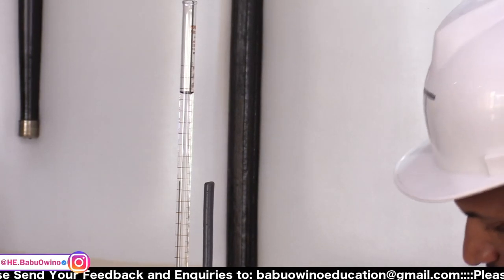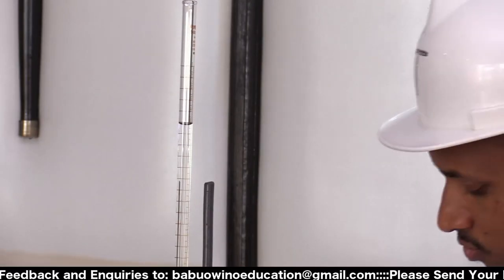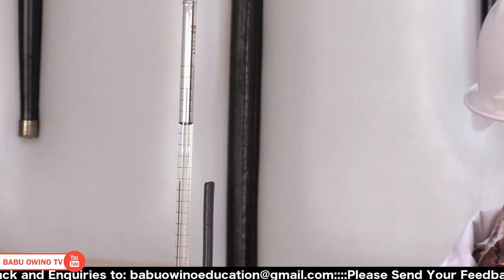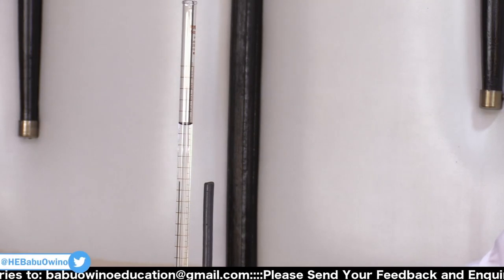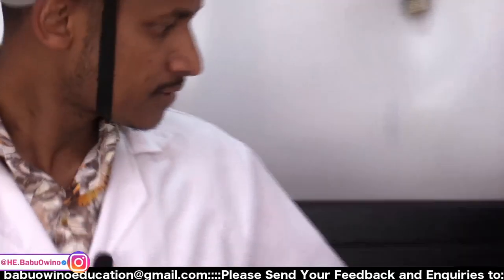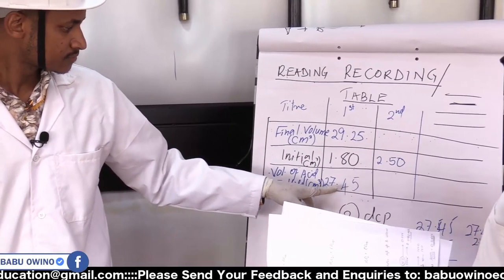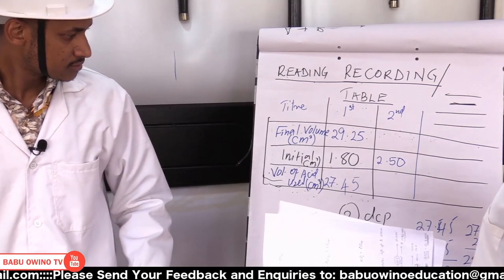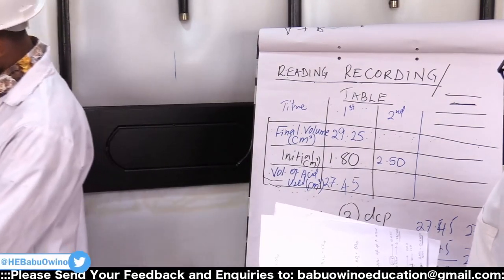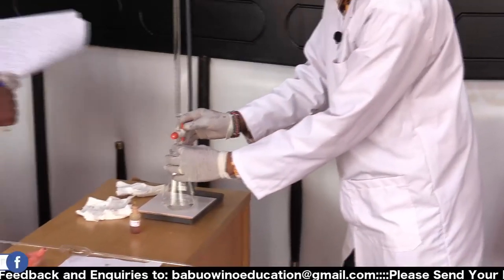Then again, we release it. 2.50. So our estimation, what we should be getting, is around 27. If you add 27 to 2.5, we'll release it up to around 29 there. 29.95, which is around 30. So you just release it up to around 20, and then we start going slowly.